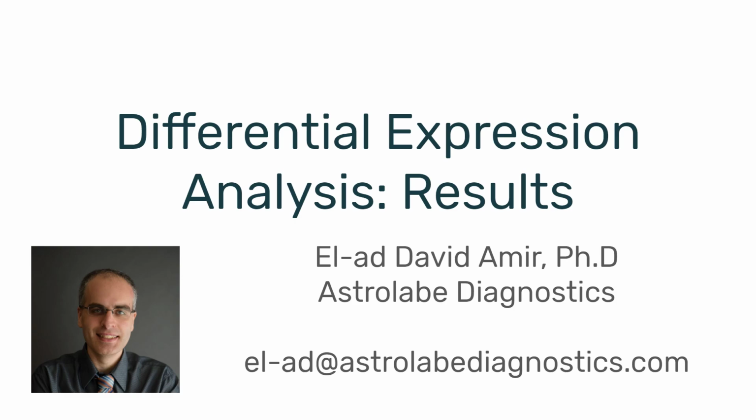I hope this video gives you some ideas on how to utilize differential expression analysis in your experiment. As with other components of Astrolabe, it's really about leveraging the power of the interface to navigate between different subsets, between different markers, and try to get these hypotheses that make biological sense within the context of your experiment.